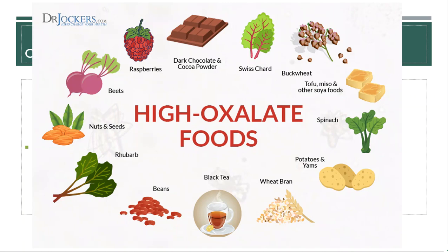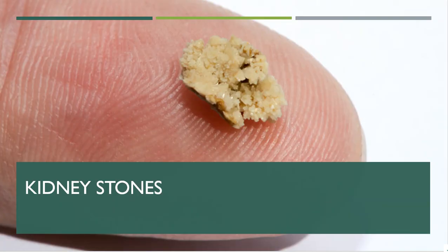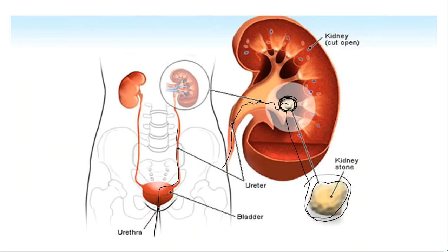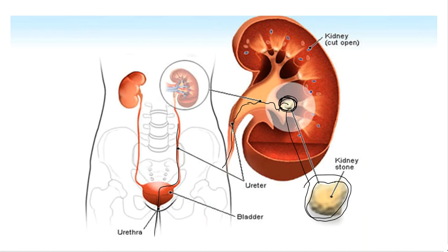We want to take a few of these beverages that we have brought to you. We will label them. You will not know what they are. We want you to process them. We want you to run them on the IC. And we want you to tell us which one of these, if any, have very high levels of phosphate. Because if they do, this is what could happen if you're not careful. And then we'll release the identities of those drinks after you measure them and after you analyze them. All right?